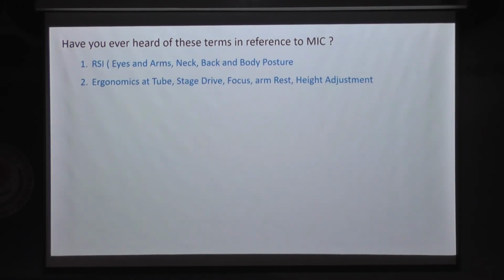It is considering the body posture, the human anatomy, in the design of these particular parts. In the earlier slides I was discussing there are some tubes which help to increase or decrease the angle within the tube. This is an integrated module. Let us say I have a microscope which was not planned to have a camera before. It is just binocular. Now I need a camera because my application needs one now.